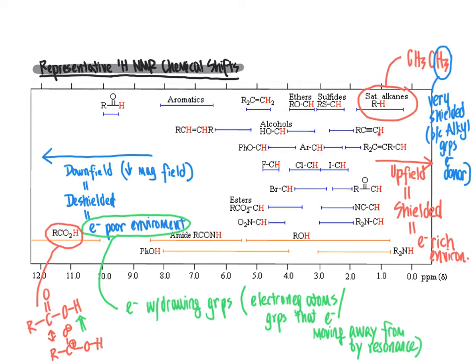And then in the middle here between, we have a variety of other functional groups. In interpreting this chart and applying it toward determining the structures of organic molecules, keep in mind that the proton that is being referenced in each chemical shift region is the proton that is shown in red throughout.